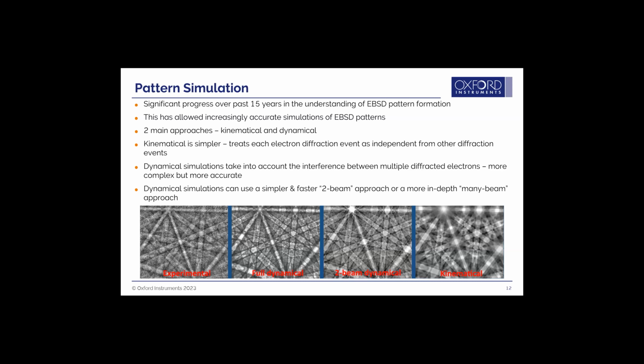If you do something that's really high symmetry, cubic materials, you can make these dynamical simulations in 2-3 minutes. It's very, very quick. You start to go to low symmetry, triclinic type cells, it can take hours, admittedly, and this becomes computer intensive, so your GPU power can be very effective in bridging the gap that you're going to have with dynamical simulations.